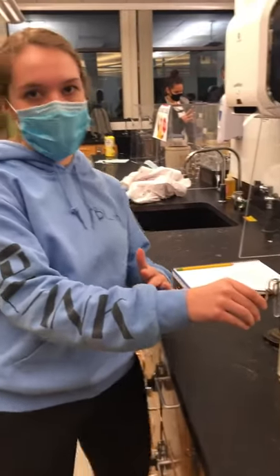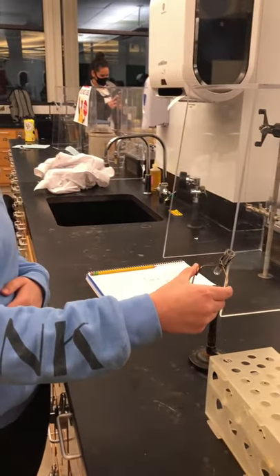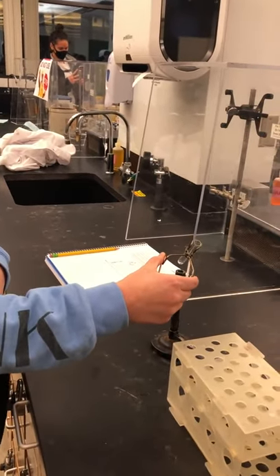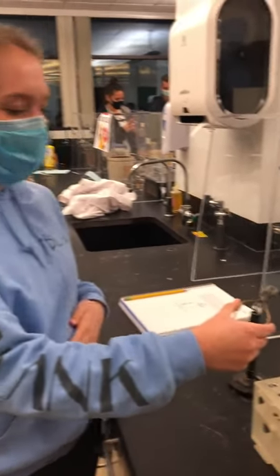You don't ever want to touch it with your hands because you'll burn yourself. And then you hold it over the Bunsen burner and you want to move it so that it heats the whole thing and not in just one spot.